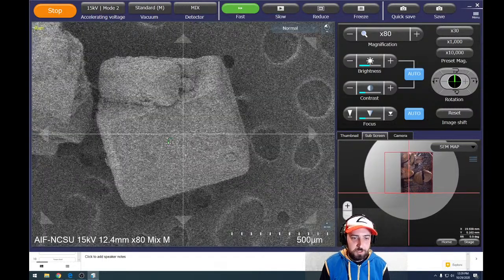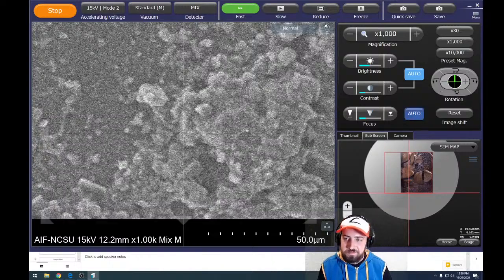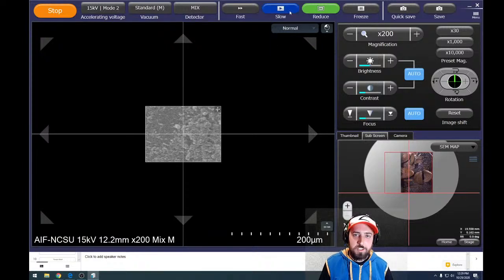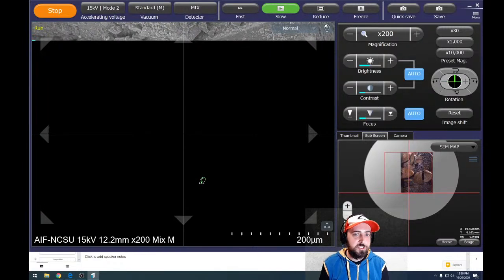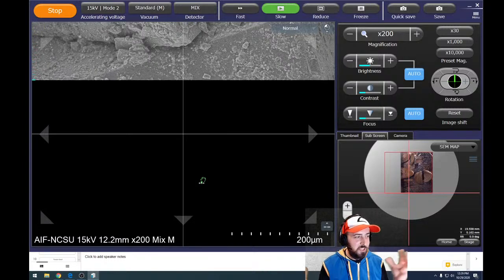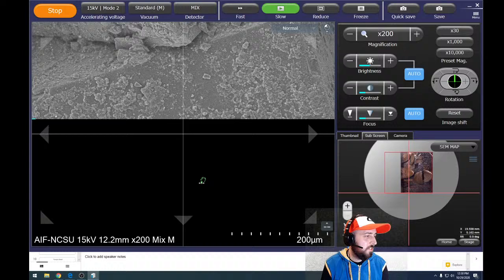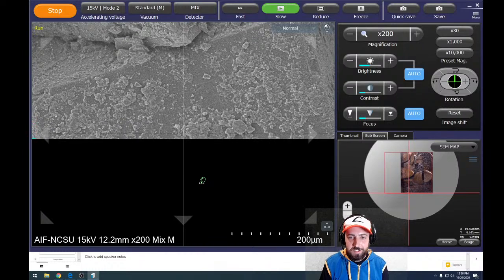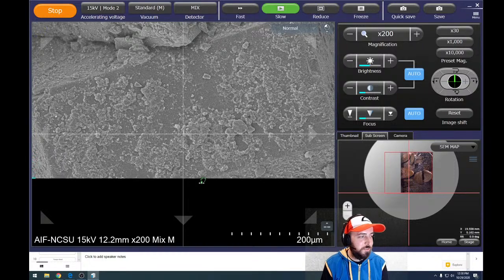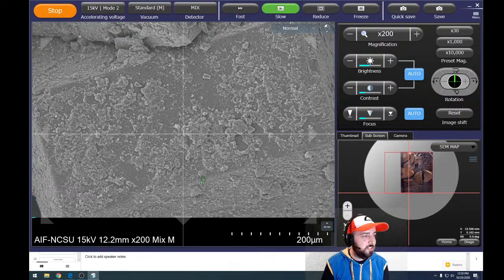We'll zoom in a little bit more. Refocus. And then we will look at the surface quickly. As this image is acquiring and we're looking at the surface of the turbinado sugar, the brown sugar, think about the size of those. I wouldn't recommend it, but imagine if you were to take a spoonful of the sugar and eat it. It would be very gritty and very crunchy, right? These crystals are hard and they're large. If you've ever gone to the mountains where they make rock candy, or you can find rock candy in stores, those are massive crystals.